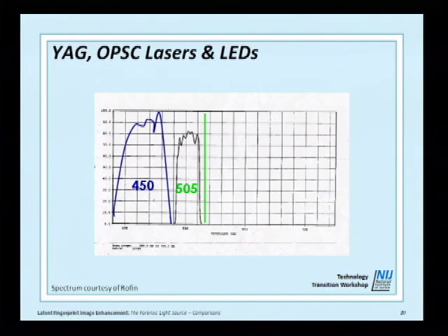So you look at that, and then you look at the 505, which is more selective, but there is the laser. These things are as different as chalk and cheese. So it would not be unreasonable to think that they would do different things. There is overlap. They do some of the same things, but there are things that the one does the other one doesn't do, and vice versa.